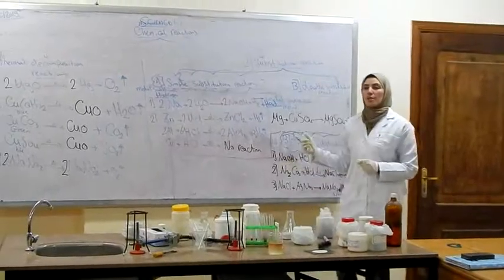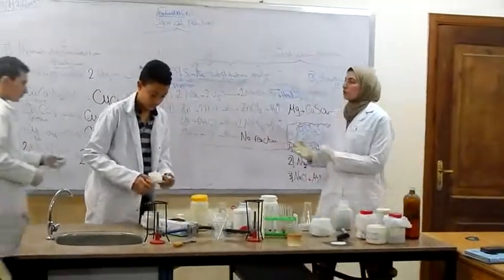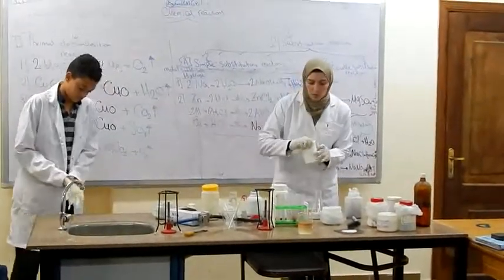Now we perform the first double substitution reaction between sodium hydroxide and hydrochloric acid.